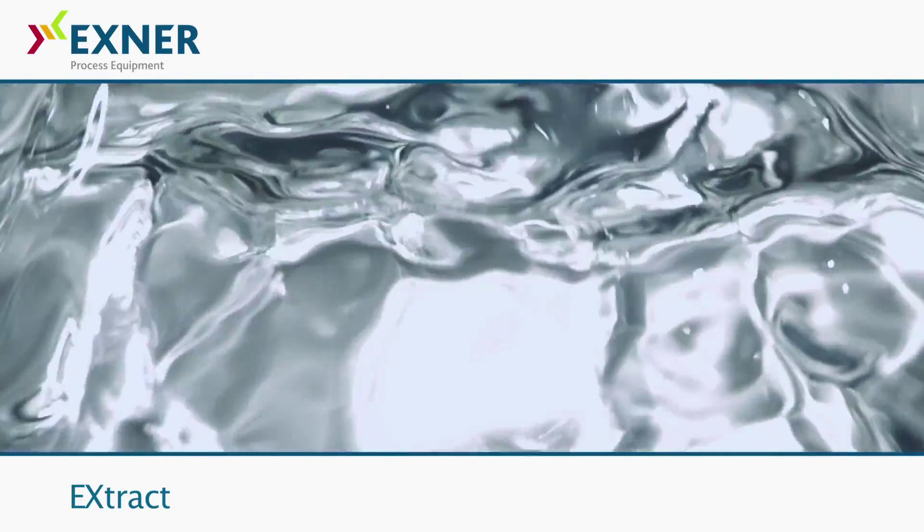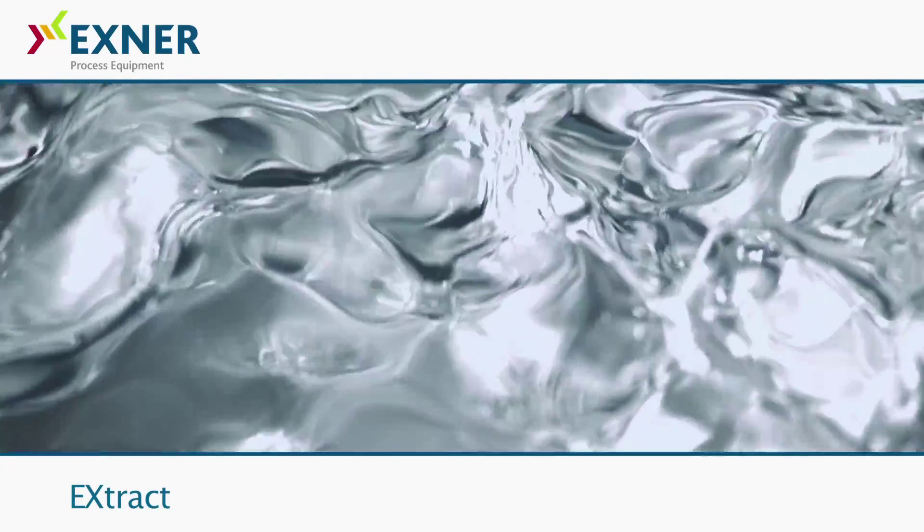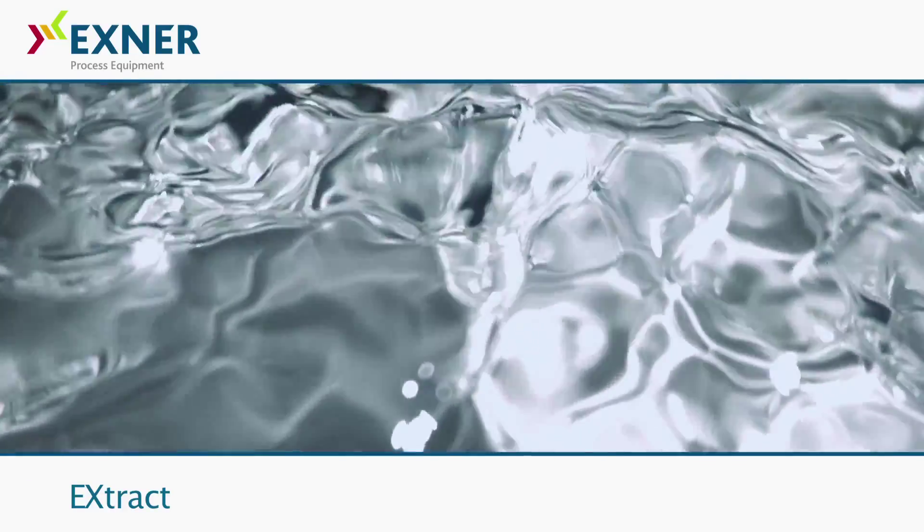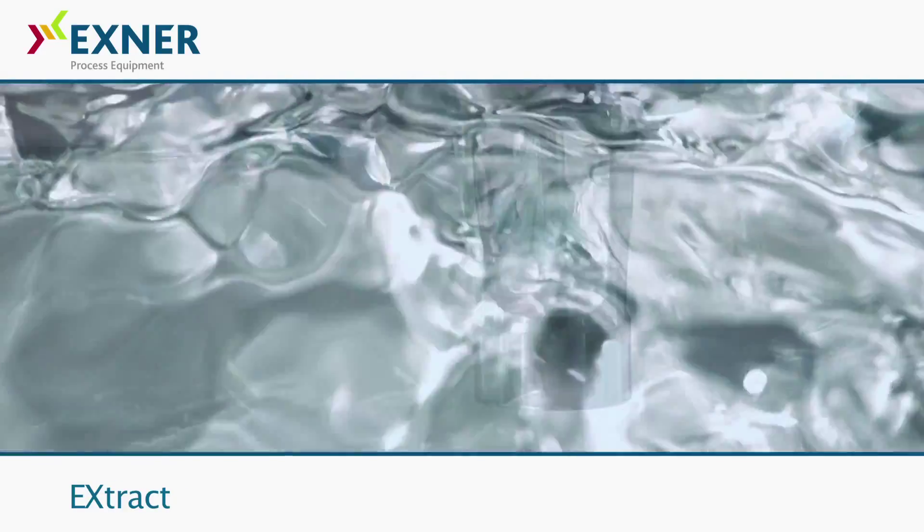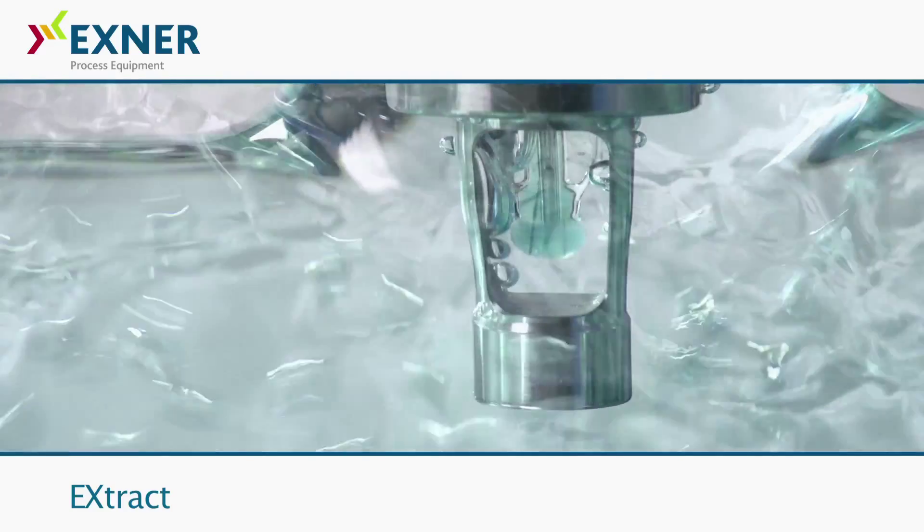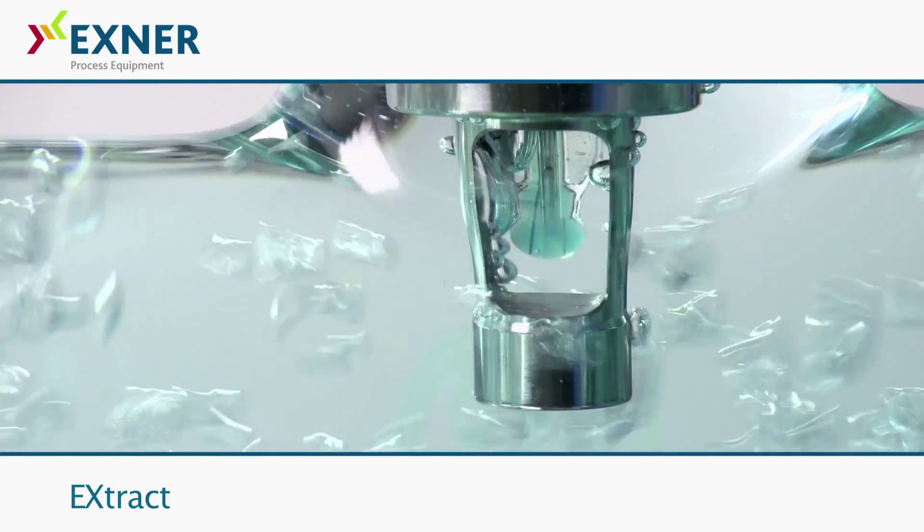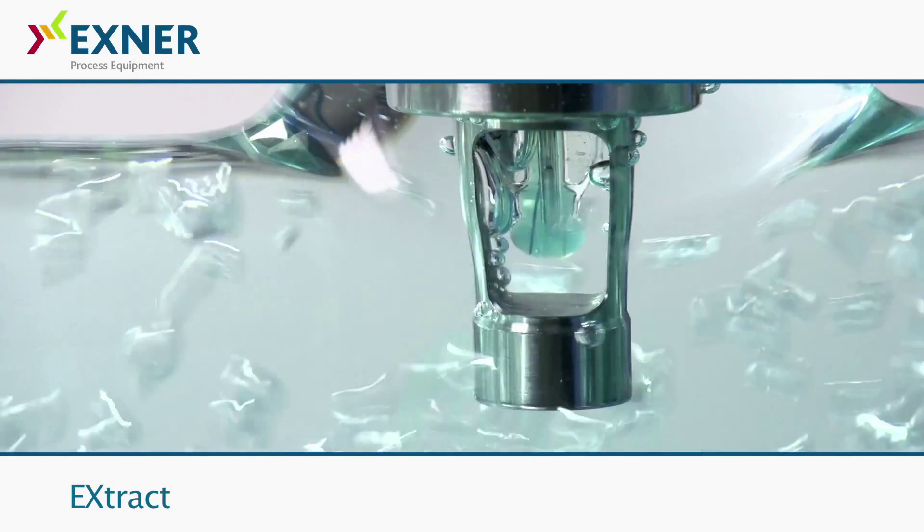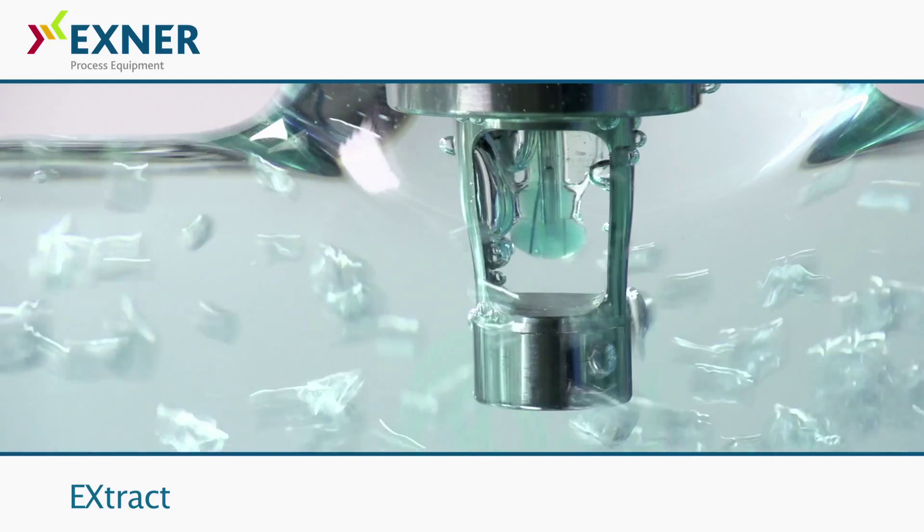In many sectors, liquid analysis is an indispensable part of process control. The standard glass sensors used for this purpose have to be cleaned regularly to ensure that readings are accurate. That usually involves high human resource costs.